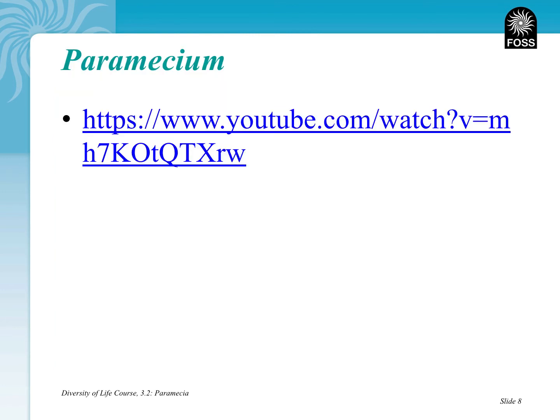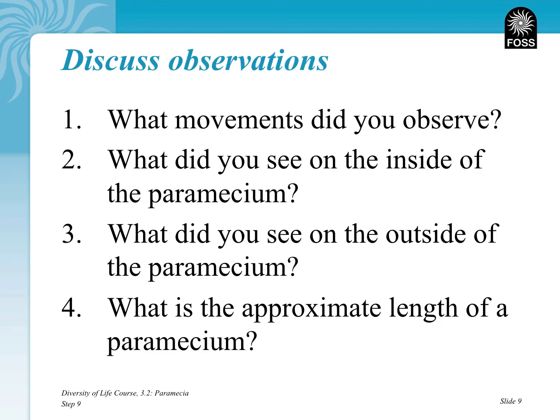This is a video on paramecium that I'm going to save for the next lesson because it covers a lot more stuff that we're going to cover in the next lesson. So we'll move past this. So let's now debrief our observations about the paramecium.